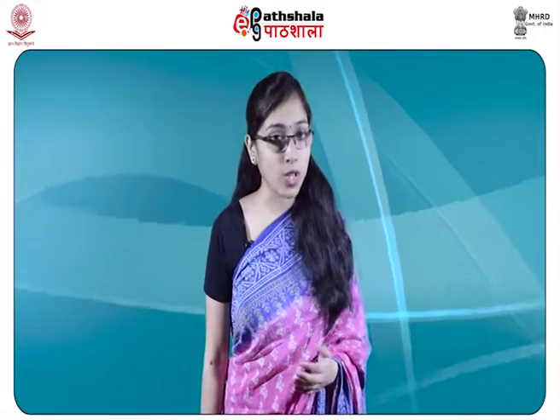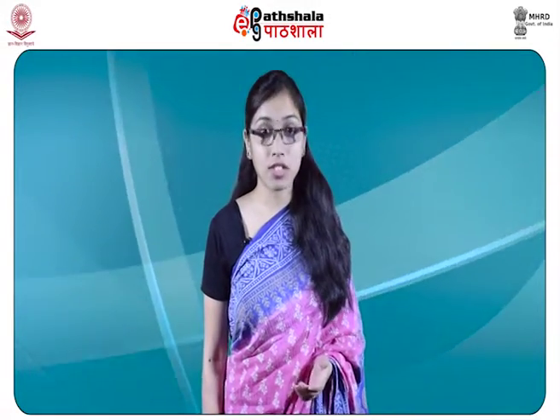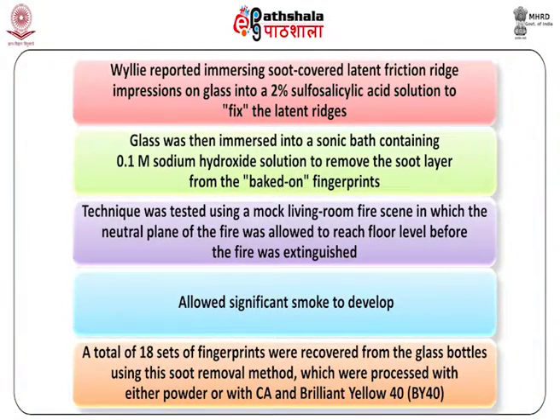Again, it was observed that soot acted as a protective layer, provided it formed on the latent friction impression before the surface experienced flames. In some circumstances, the formation of the soot layer helped to bake the friction ridge impression onto the metallic surface.